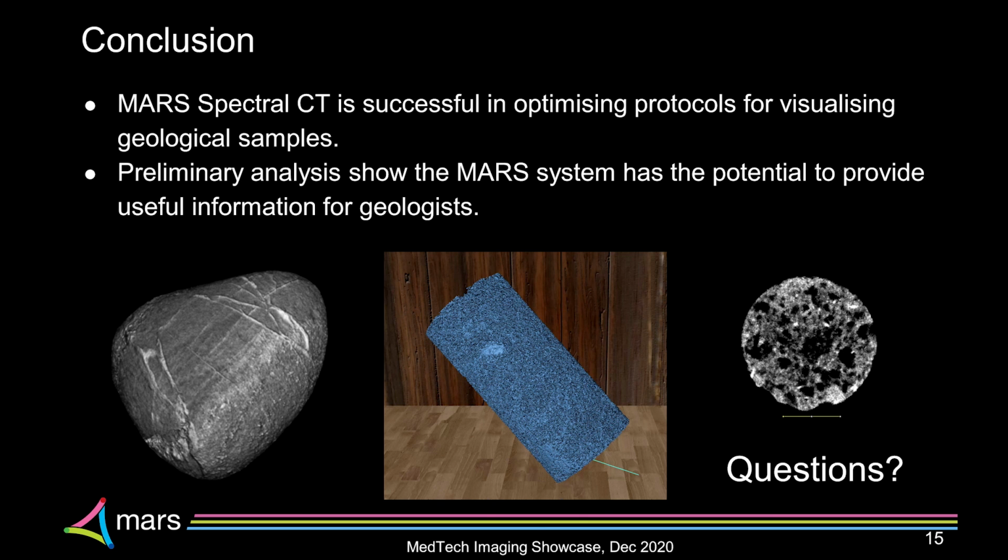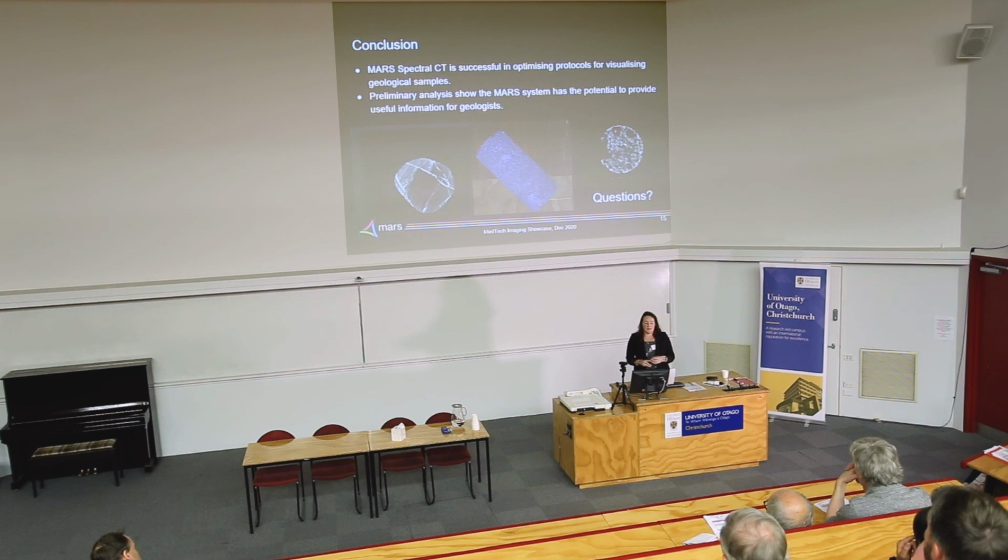So in conclusion, Mars CT is successful in optimizing protocols for visualizing samples, and the preliminary analysis shows that we do have the ability to provide data for geologists that would be useful.